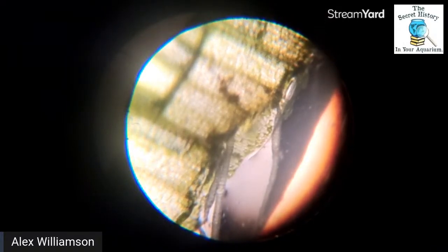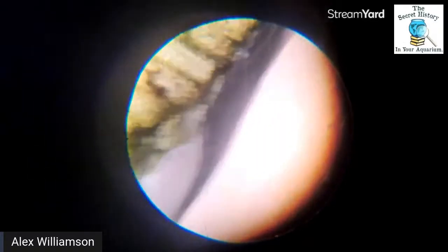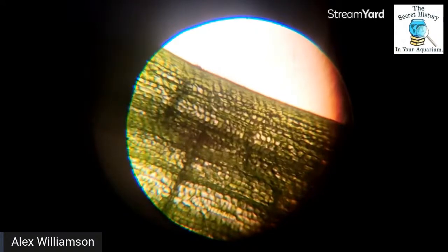So on the edge of this, you can actually see the chlorophyll coming out, the green, where I cut it. And you can also see that the cut just smushed things. Now, what I want to show you guys again on here is, let's find one that's really obvious. I mean, the human eye can actually make out the cells on these. Look at them. There's some cells right there. And then there's the cell superstructures.